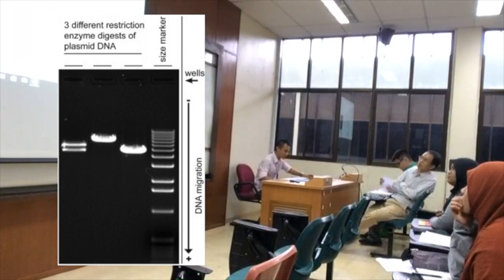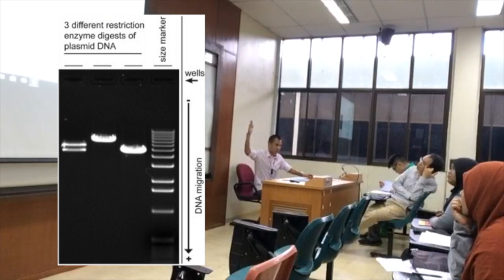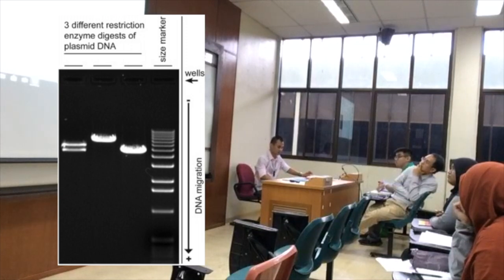So this will be your agarose gel that you can see. So you can see your target gene. That's your target gene. Normally, your whole genomic DNA will be up there, and then your primer will be somewhere very low, and it's already gone because you let them run. Normally, the primer is too small; it's already gone.